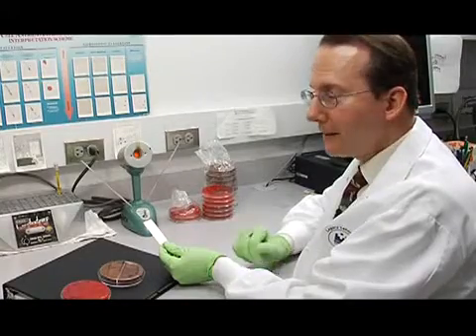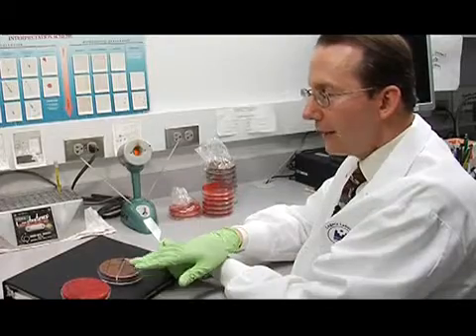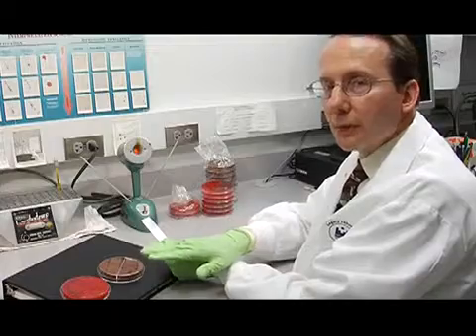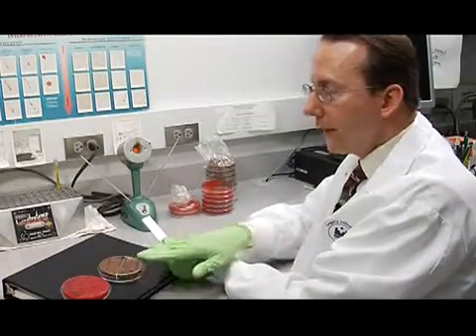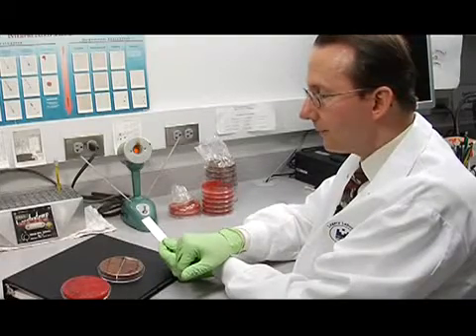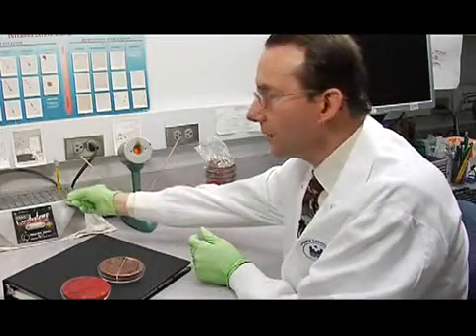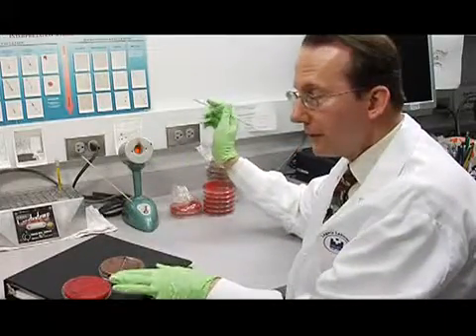So now we have inoculated the blood agar plate, the chocolate agar plate, the Martin Lewis medium, and made our smear. This is the general sequence for setting up any culture. It's always the blood agar first, then the least inhibitory to the most inhibitory. In this case, chocolate agar, then Martin Lewis agar, and then always make your smear last. You can place your smear on a heat block to make it dry faster if you like. Now we're ready to streak for isolation.